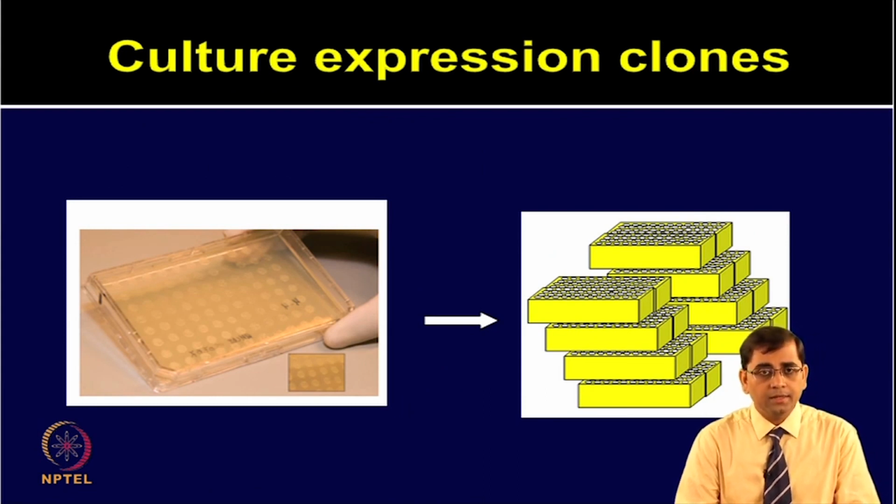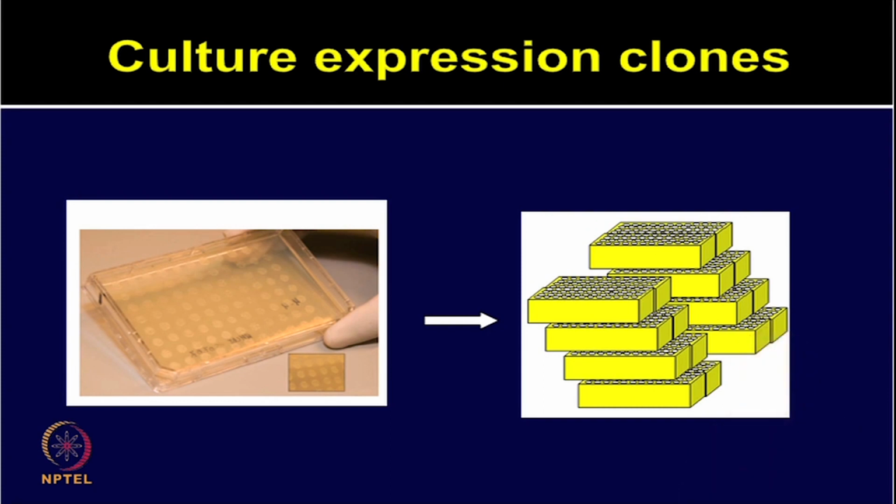The only difference here is that things have to be much more automated, and the steps have to be much faster and in a high throughput manner. If you are performing these plasmid preps in tubes, then you have to do it many times, which will increase irreproducibility and manual artifacts. So, all these steps are preferably performed using an automated liquid handling system. It is difficult to achieve high density, so all these steps need to be automated.